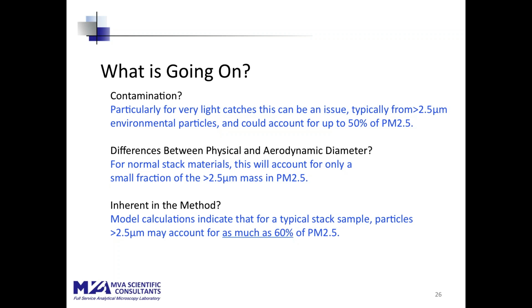Well, we see some limitations in the method in that it doesn't actually measure PM2.5 very well. It grossly overestimates it. The other question comes around suitability for use for protecting human health and welfare. Consider a PM2.5 sample that is composed all of 2 micron particles and a sample of the same weight composed all of 0.2 micron particles. These would be given the same weight in importance in defending human health and welfare, even though they are very different particle populations.